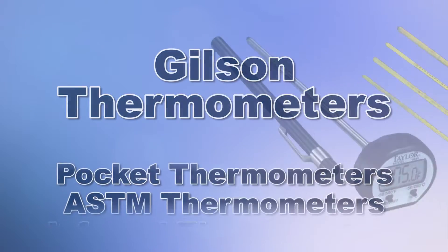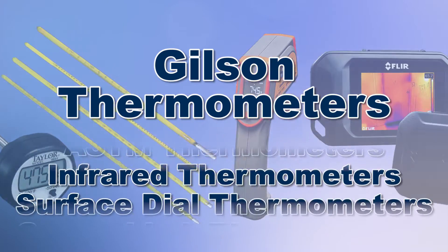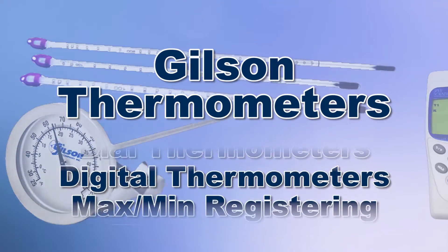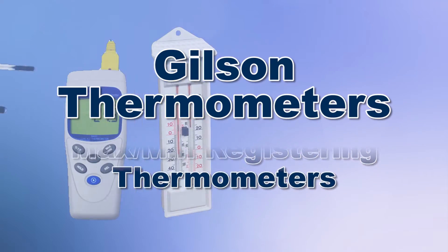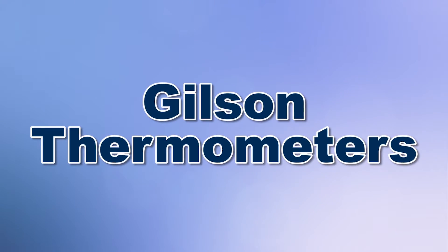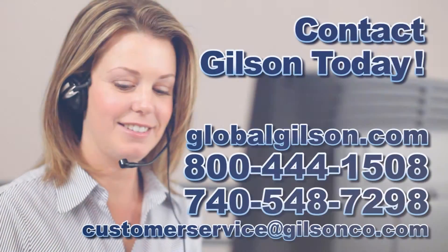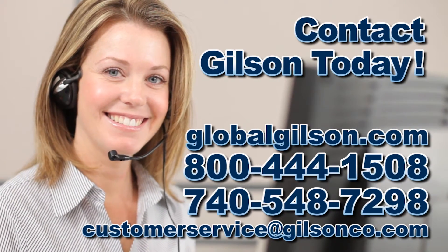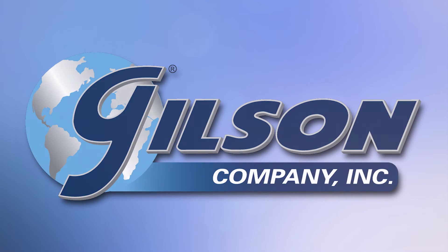With Gilson's complete family of temperature measuring equipment offering a wide range of performance features and capacities, Gilson has the right equipment for your accurate temperature determinations. Be sure to check out these and all our products listed in the Gilson catalog and on the Gilson website. Gilson — your industry leader for material testing equipment.